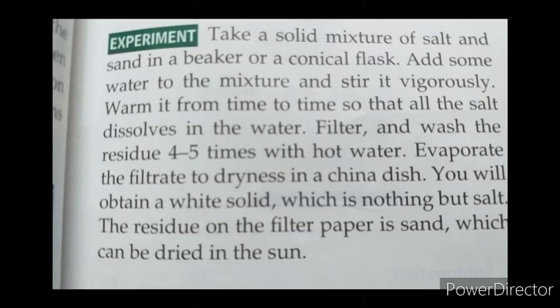Evaporate that filtrate to dryness in a china dish, and then we will get a white solid. Right? That solid is what? It is salt. And the residue on the filter paper is sand, which can be dried in the sun.